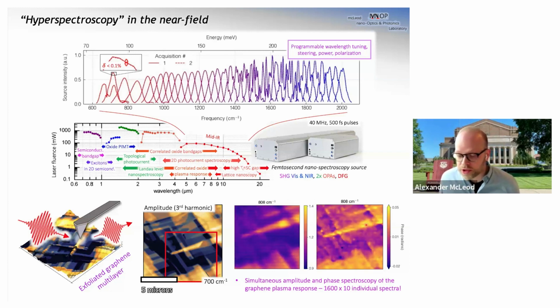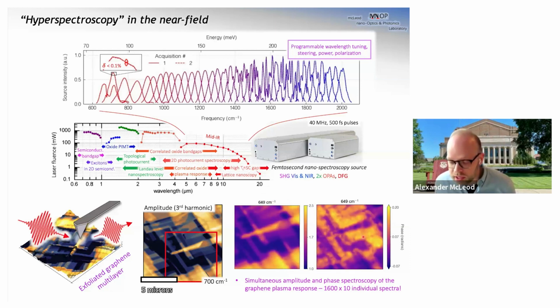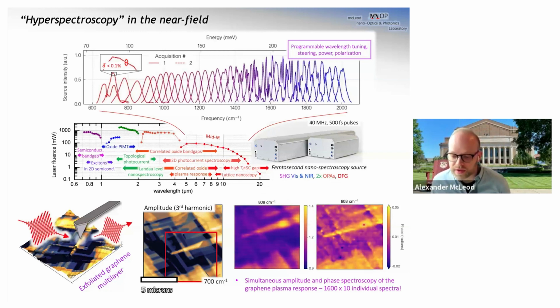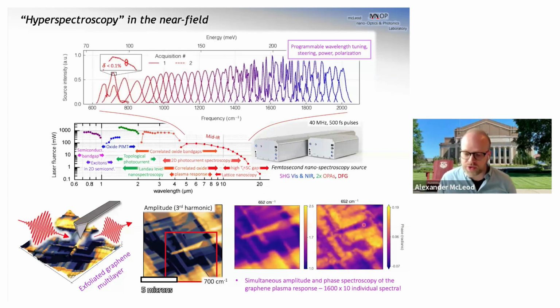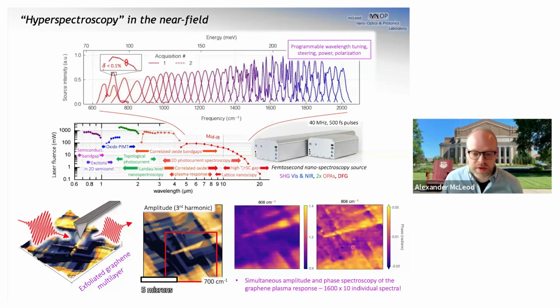The absorption is high at certain energies in certain regions, and low at other regions and at other energies. What this shows is that different multilayers of graphene have different optical properties. Some have strong absorptions at certain energies owing to, let's say, interband transitions, and others are strongly absorbing due to free electrons or plasma resonance in those materials.